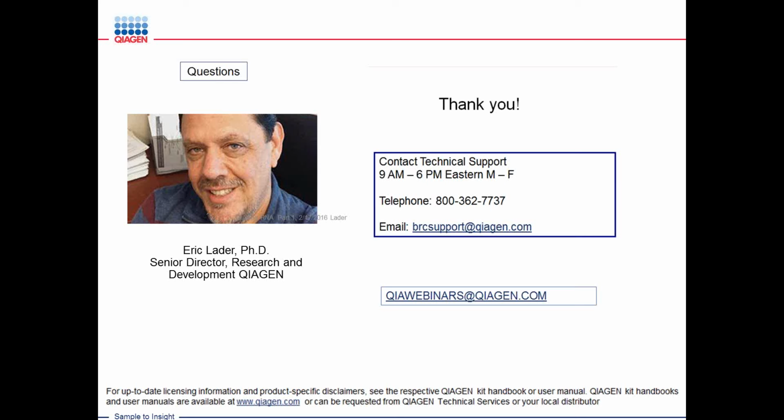Okay, thank you, Eric. The next one is: would this system work on ION Torrent system? Yeah, we routinely use it on the ION Torrent. The sequencing on the ION Torrent is quite good, and the single-ended reads on the ION are long. It's fine. Yeah, the read budget's a little smaller, but it's fine.